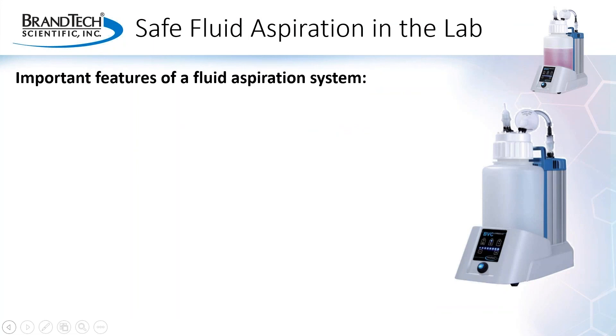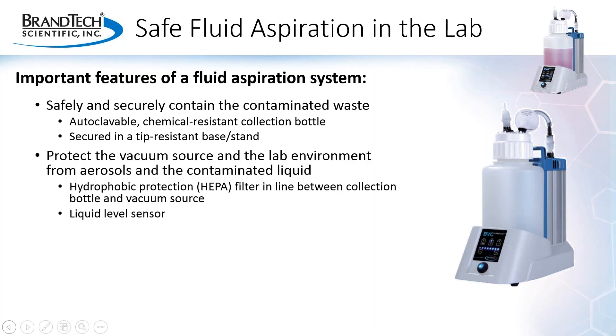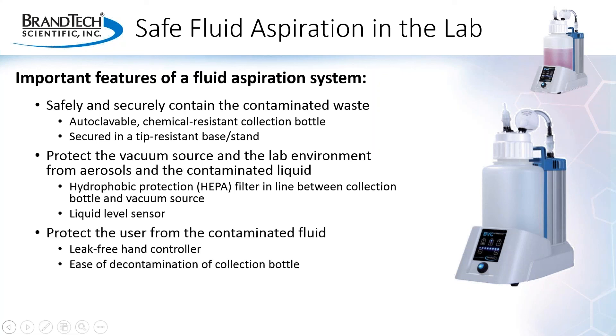So to review, features that are important for a safe fluid aspiration system in the laboratory are: the waste needs to be safely and securely contained, meaning an autoclavable and chemical-resistant collection bottle securely seated in a tip-resistant stand or base. The vacuum source and lab environment should be protected from aerosols and contaminated waste, which requires at least a hydrophobic HEPA filter in place. A liquid level sensor provides an additional safeguard. The user should be protected from the aspirated fluid as well, by a well-designed hand controller and a collection bottle that is easy to decontaminate. And of course, it should be easy to use.